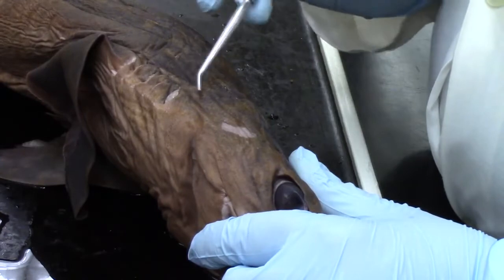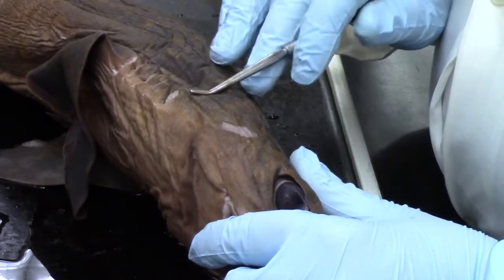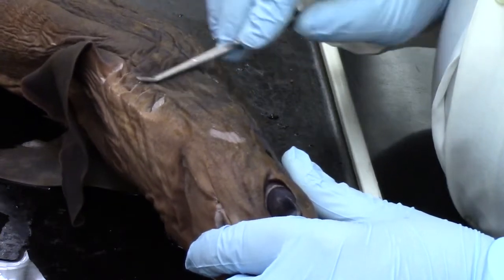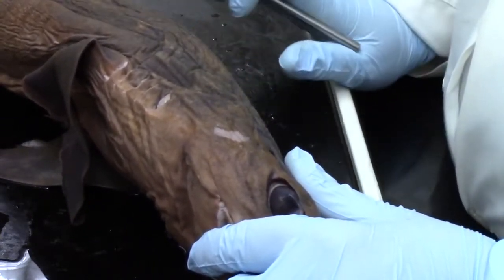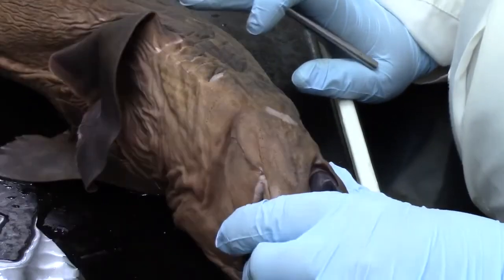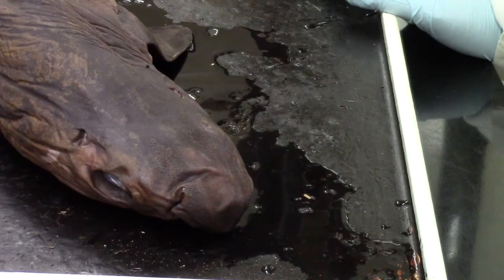Here we can also see the shark's gill slits. So that's going to be where the water will pass out of the animal once it's passed over the gills. We will take a look at the gill structure in just a moment. I will now change our view a little bit and start doing our actual dissection.